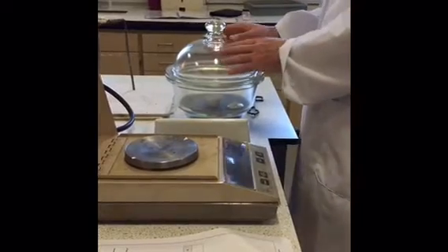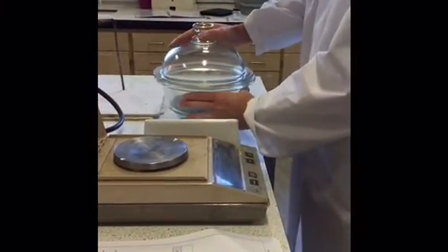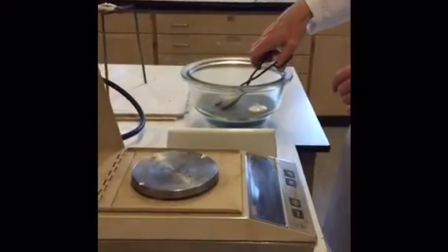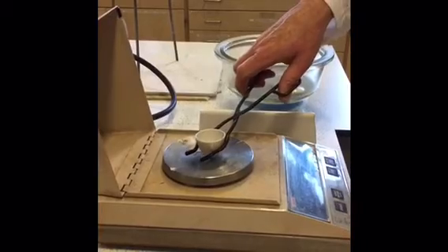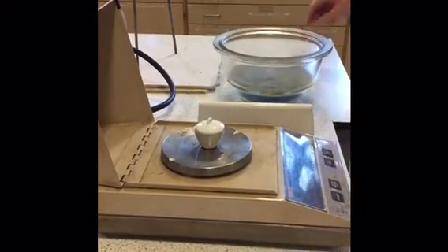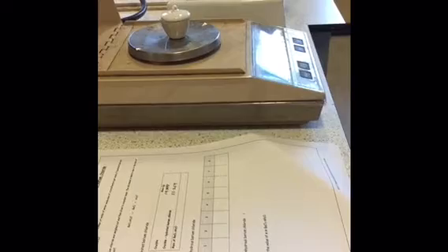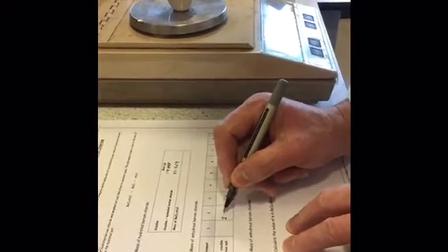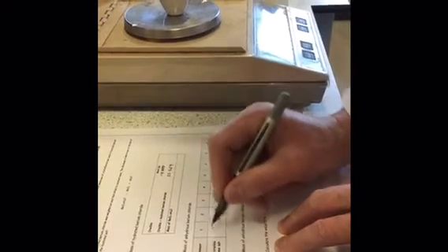Right, so the sample has been cooling down for about 10 minutes, so we can now weigh it carefully. So put it onto our zeroed balance, along with the lid of course. Let it settle, and our new reading is 21.940. I'll put it in for the second reading, 21.940. My first reading was 22.269. So we've dropped from 22.26 to 21.94 due to the loss of water.